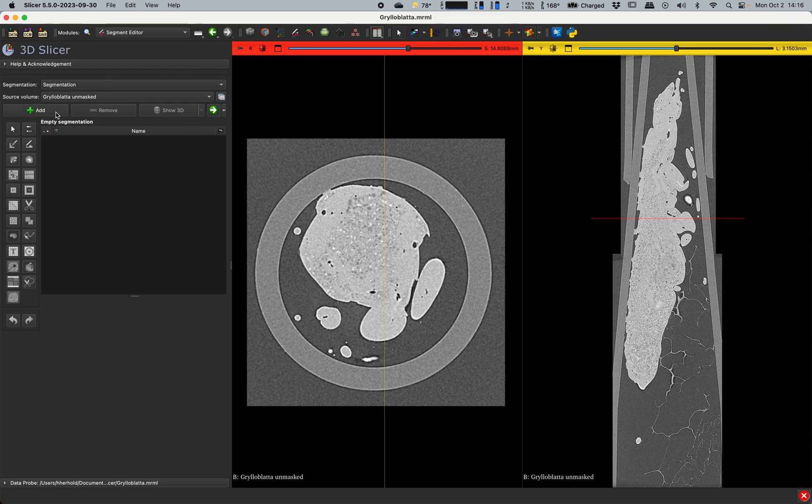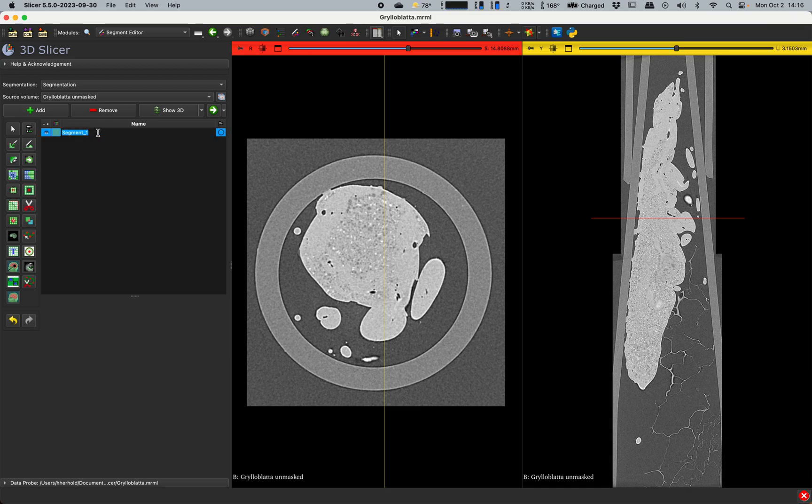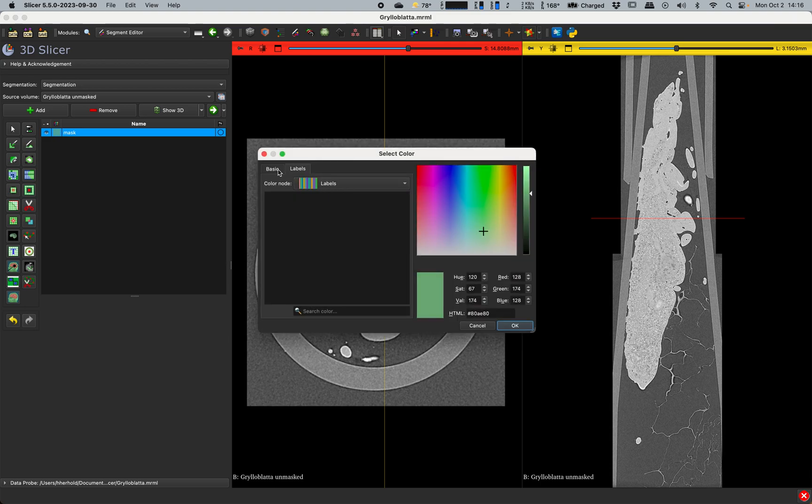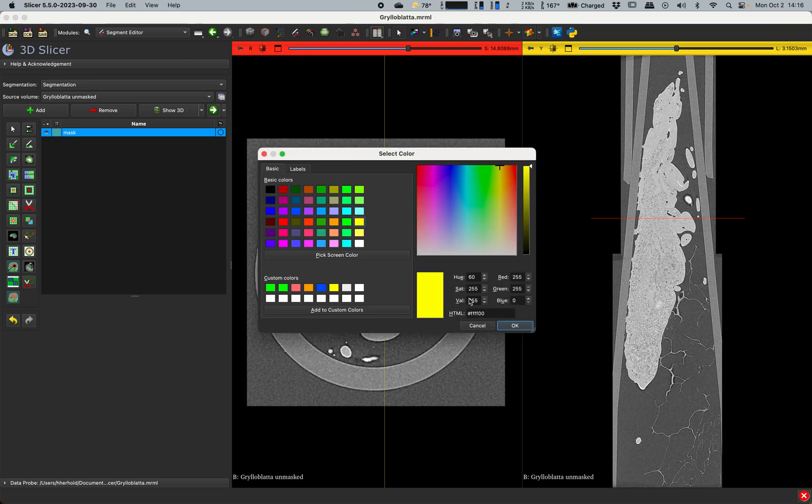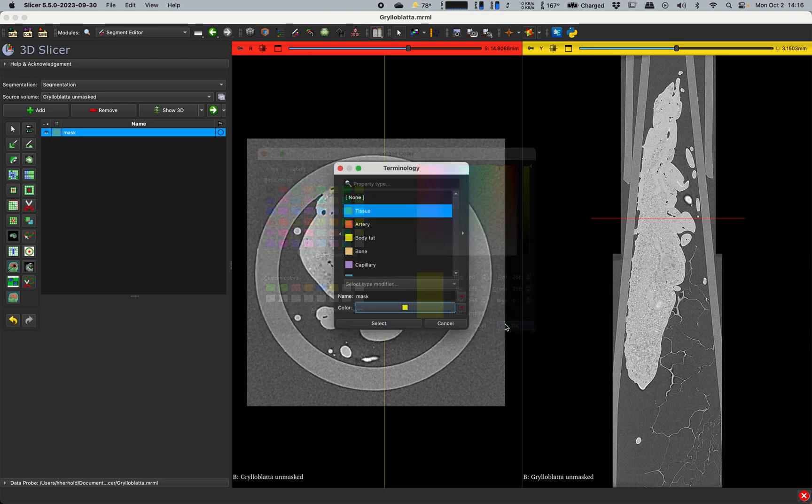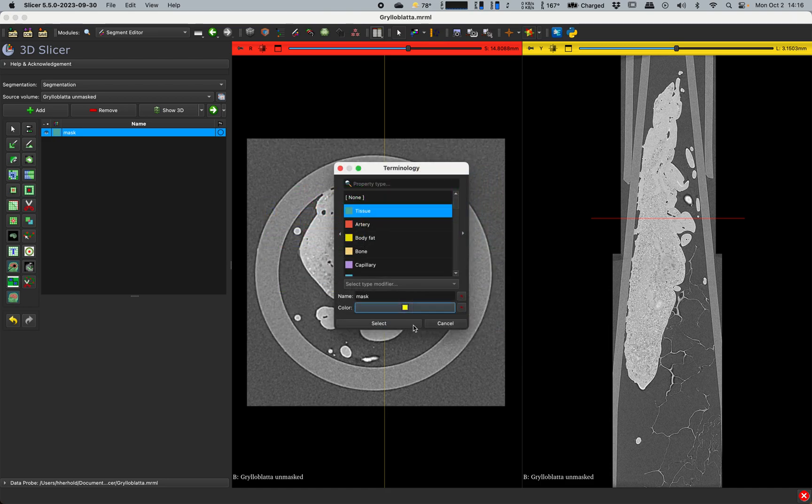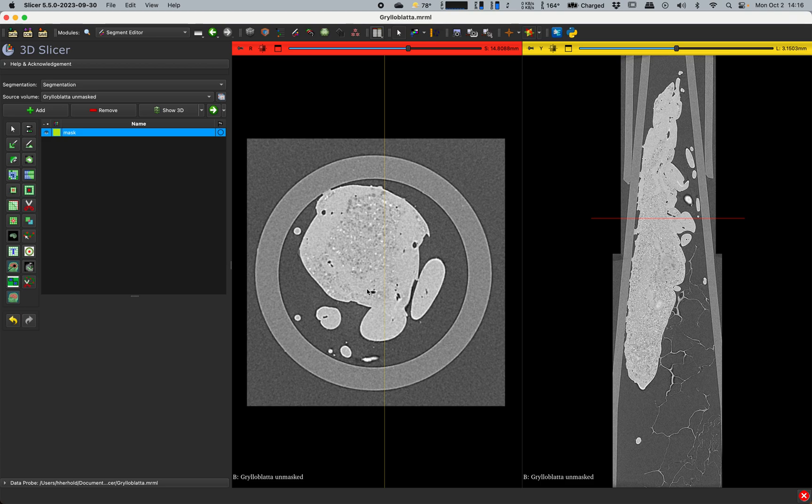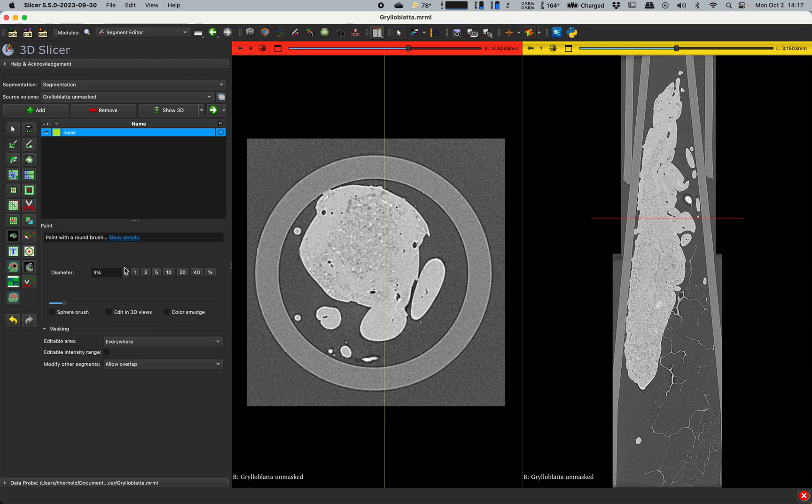What I'm going to do is create a segment that I then use to mask off everything that I don't want. So I'll go to the segment editor. I'll add a new segment. I'll call it mask. I am a tiny bit red-green colorblind, so I tend to make things easy for me to see by changing the color here like that. Then what I will do is I'm going to use the fill between slices feature of Slicer to mask a number of these slices through the length of the insect.